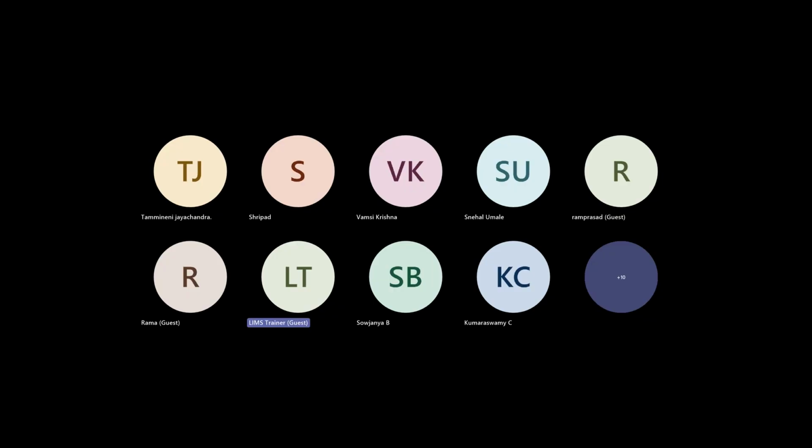Because even if you get into LIMS, LabWare LIMS, if you do testing, you need to enter values. You need to see whether it's out of spec or not. You need to know why these two components are getting added. You need to know what a variation is, what a product is, what a sample plan is, what an item code is, right? Which will be covered.